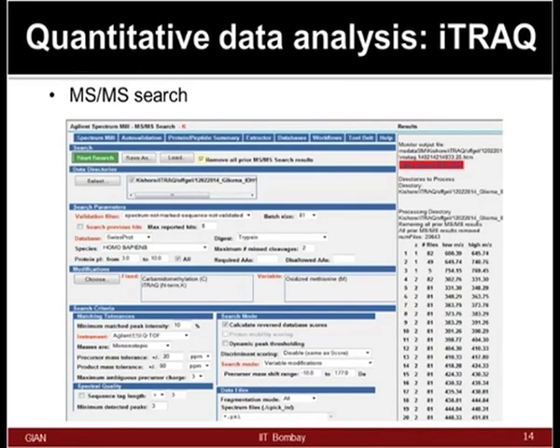So, then you will go back for doing an MS search from the same samples, and now you have to look at various parameters, for instance databases and what protein isoelectric point you are expecting, because you would have used off-gel fractionation, for example. So, you know which pI value you have used, right, 4 to 7 or 3 to 10. You are looking at what kind of fixed modification and variable modification you may have, what instrument platform is used, monoisotopic mass, and what precursor and product mass tolerance one needs to define.